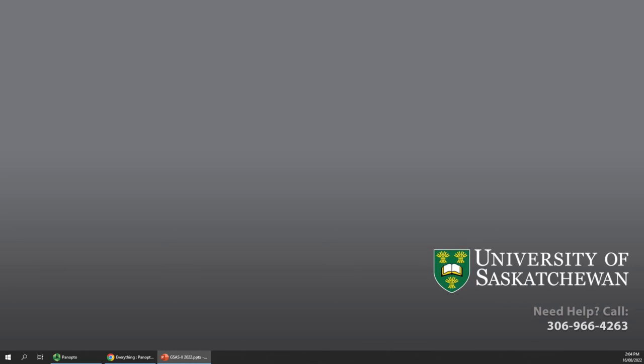As I said, any good idea out there is worth stealing and sticking in, with suitable references put in every place, so that if you use any one of these special things, GSAS-II will tell you, please cite someone else's work, which is where I got it from.